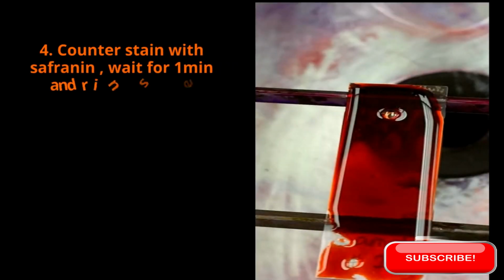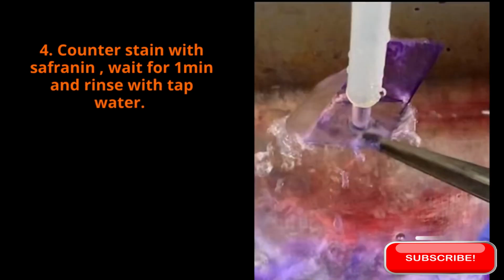Counterstain with safranin, wait for 1 minute, and rinse with tap water. This stain is taken up by both gram-positive and gram-negative organisms, but does not alter the color of gram-positive organisms much, as they are already purple. It does, however, make the gram-negative organisms pinkish red. Blot dry or air dry the slide and examine under the microscope.